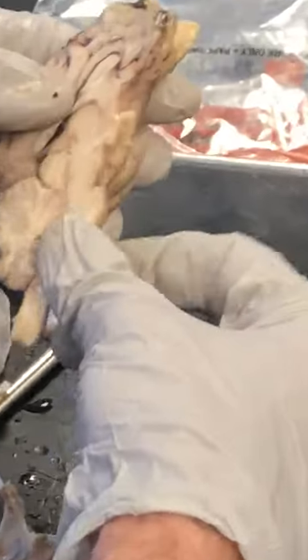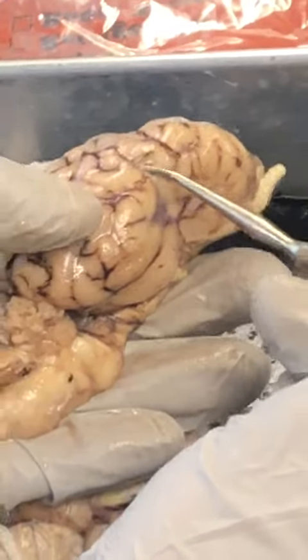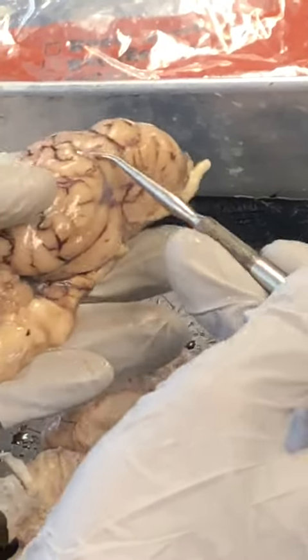Yeah, see, that was pia mater. It was peeling away. Did you see that thin film? It was peeling away from the surface. This is all shiny pia mater there. Yeah, the probe is actually under the pia mater now. A very, very shiny thin film.